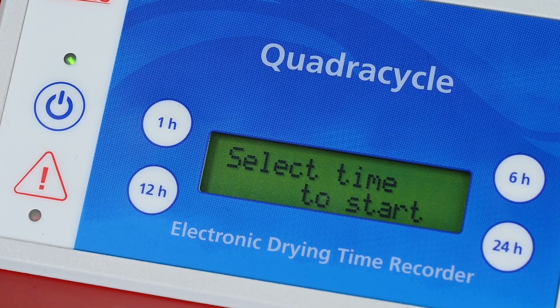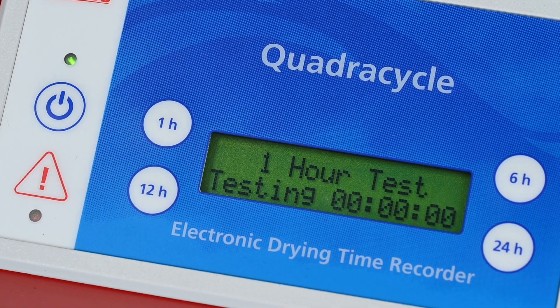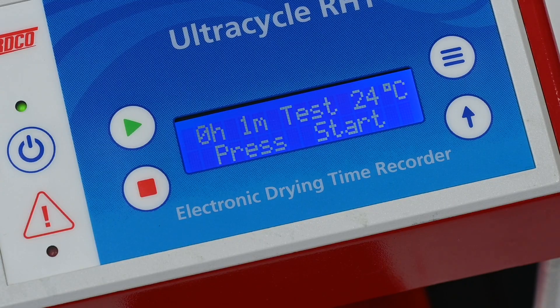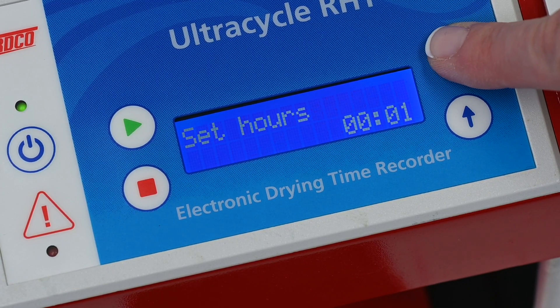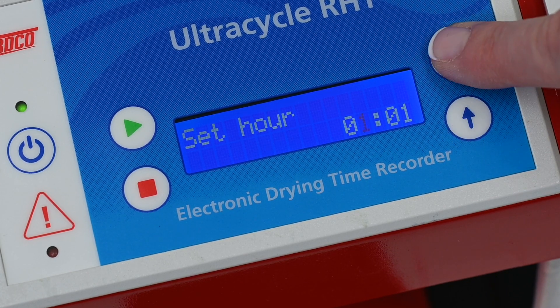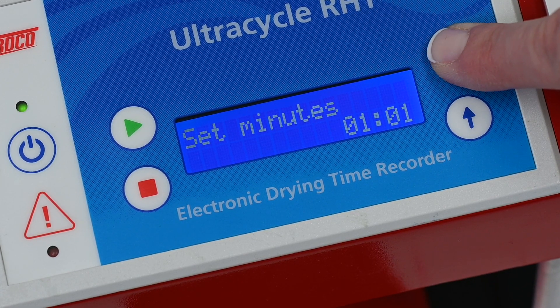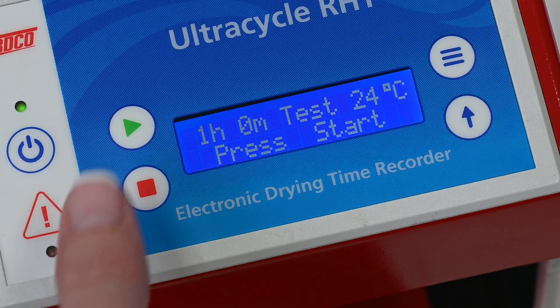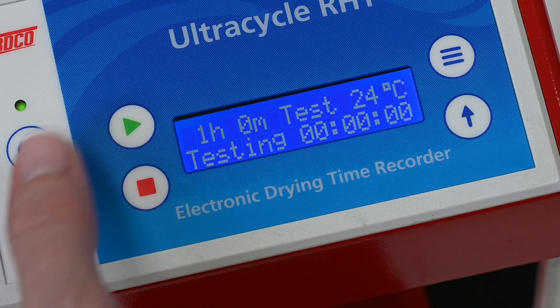If using the QuadraCycle, simply select the desired time and the test will begin immediately. If using the UltraCycle, press the menu button to set the time cycle. Use the scroll button to choose the hours or minutes required, then press the menu button again to enter the selection. Press the start button to begin the test.